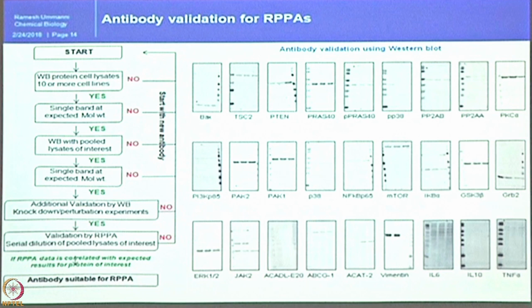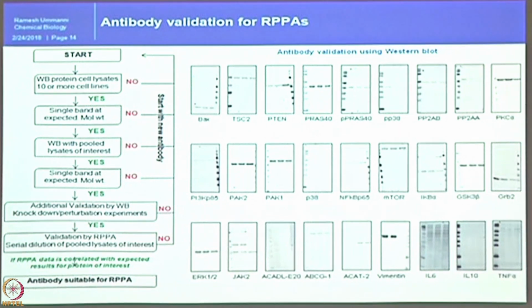You can see that some of the bands are very nicely giving single bands, some of them are non-specific bands, and here you can see that this is completely crap, you cannot use them. And mostly with my experience, I am not a brand ambassador for any antibody company. Here at least I had a good experience with Cell Signaling, and a very bad experience with Santa Cruz. I do not want to offend anyone, please, it was just my experience I am sharing with you, on a lighter note with the student community here.